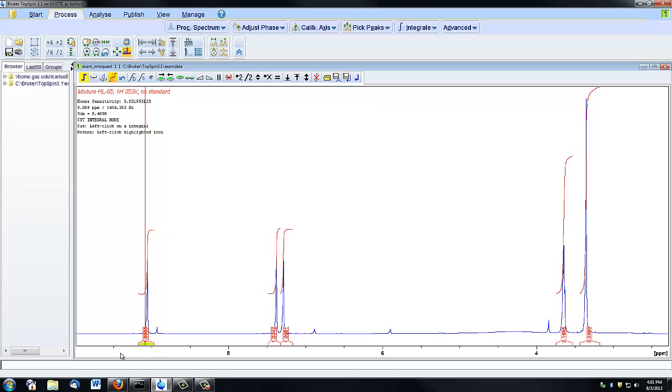So if I have this integral selected and then I click on this bias correction icon and click and drag up and down, you can see that the lines are changing, and the same thing happens with the slope. So you can just mess around with those until you've got a nice integral shape, and you'll notice that the value actually changed when that happened, which is important because you're getting more accurate results if you actually do this. So if I move on to the next integral, I can do the same process again, just evening that out.